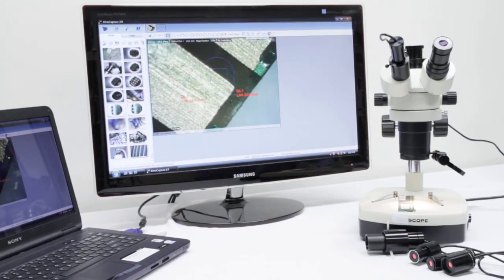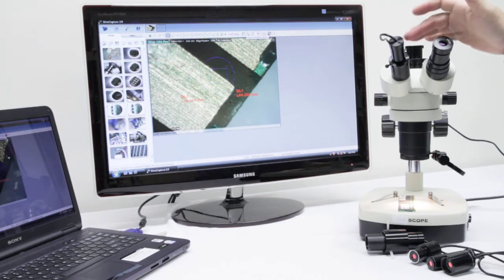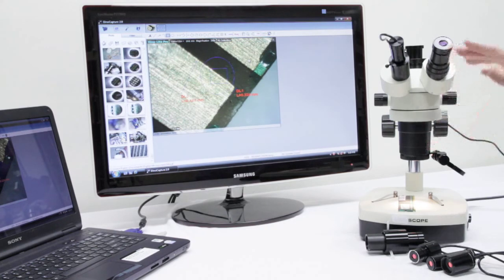To measure, just enter the magnification, which is the microscope's objective lens power multiplied by 72.5. As an example, we have an objective lens of 4 times 72.5, which is 290.